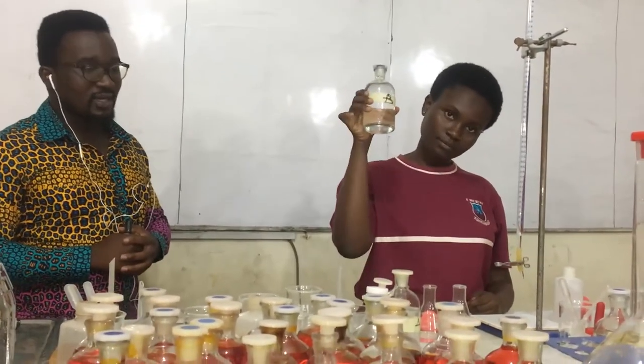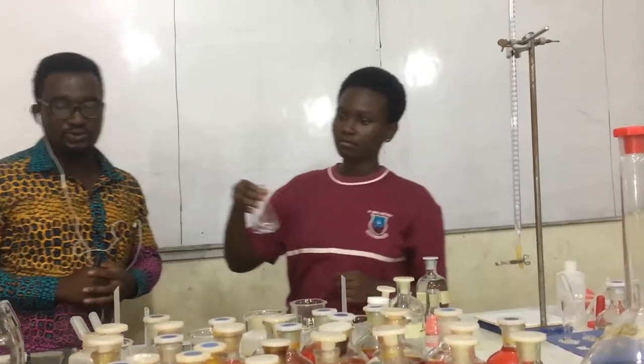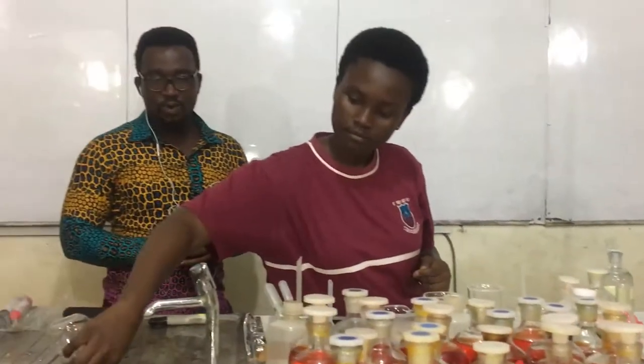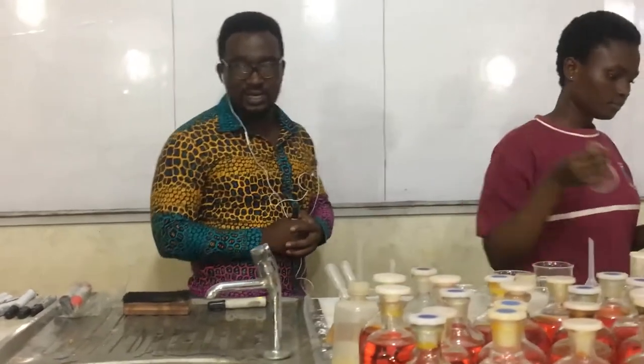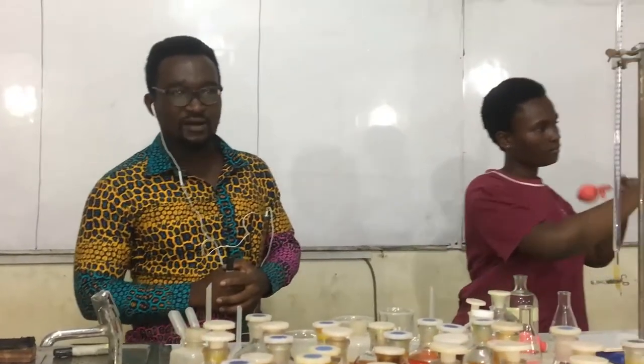Now, our madam will still continue with her action. That is solution B. So let's see what she's going to do. She's pouring away the deionized water, which was used to rinse the Erlenmeyer flask, or the conical flask.